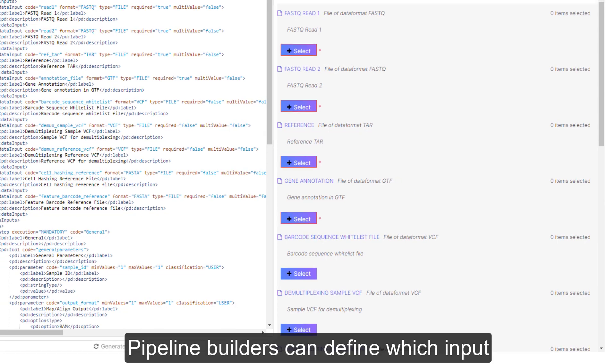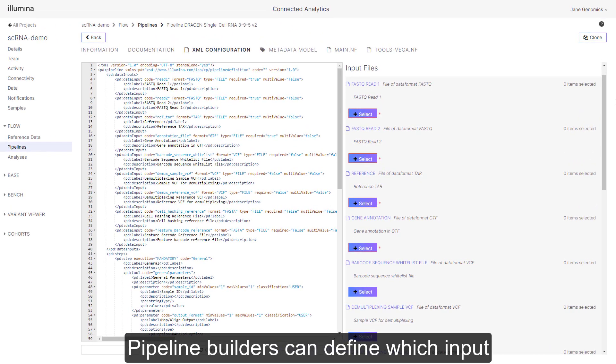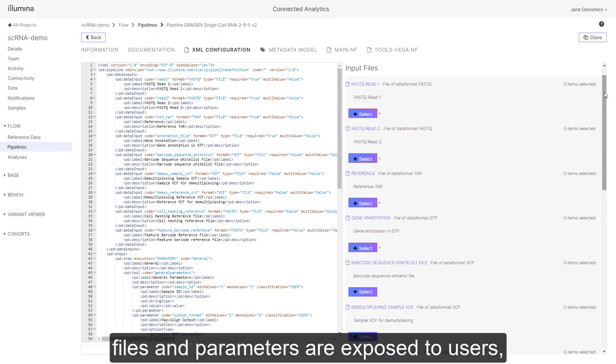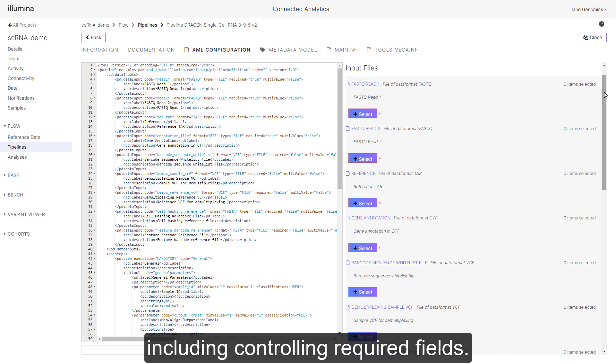Pipeline builders can define which input files and parameters are exposed to users, including controlling required fields.